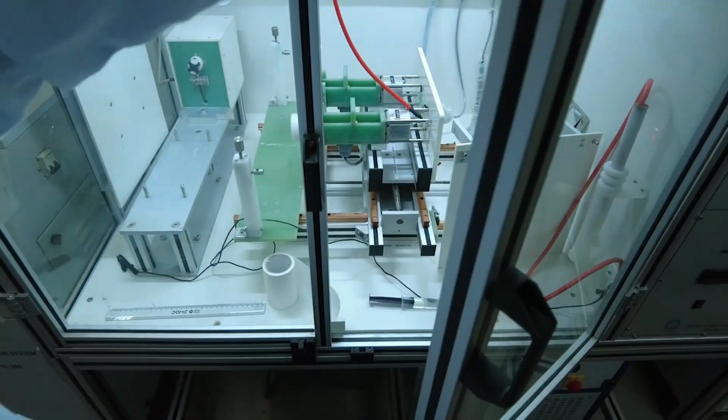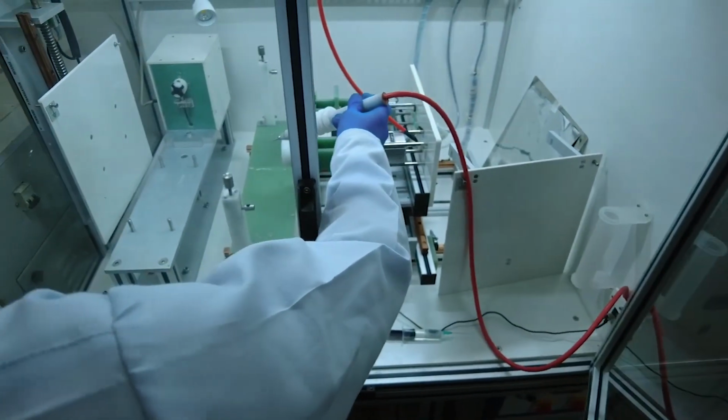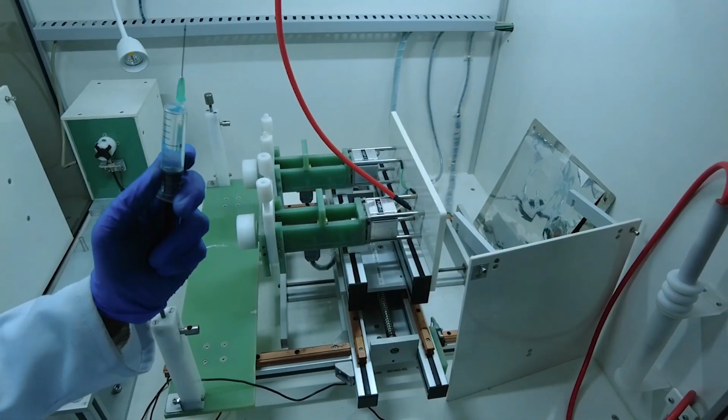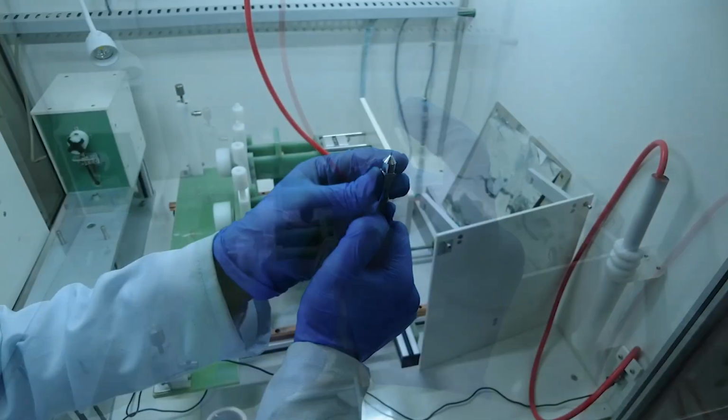Open the door. First, use the grounding rod to ground all components. Next, place the syringe with the spinneret in the holder.